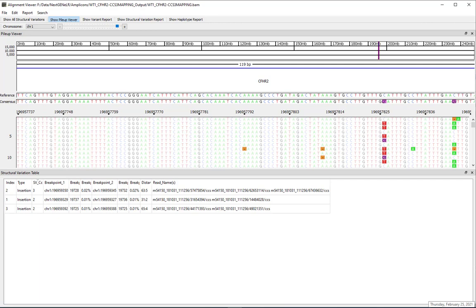Below the pileup viewer, a report pane is shown. The structural variation report, variant report, and haplotype report can each be shown in this pane based on which report is selected for display. The default report shown when a sample is first opened is the structural variation report. The chromosome drop-down menu also determines which chromosome is displayed for the report.